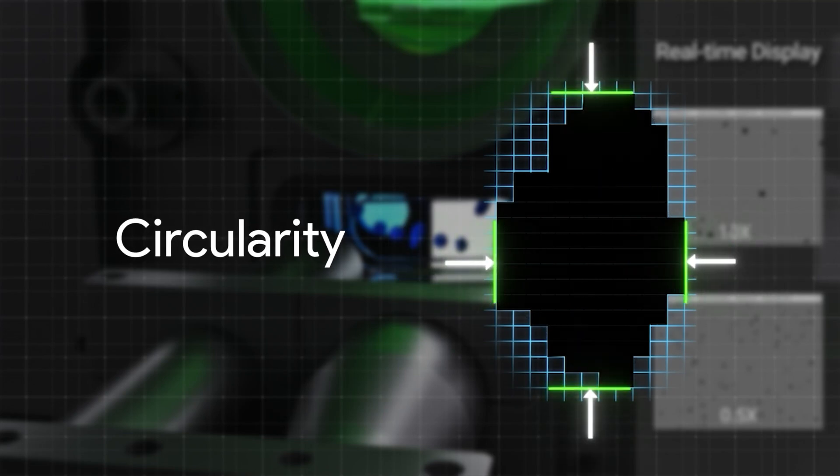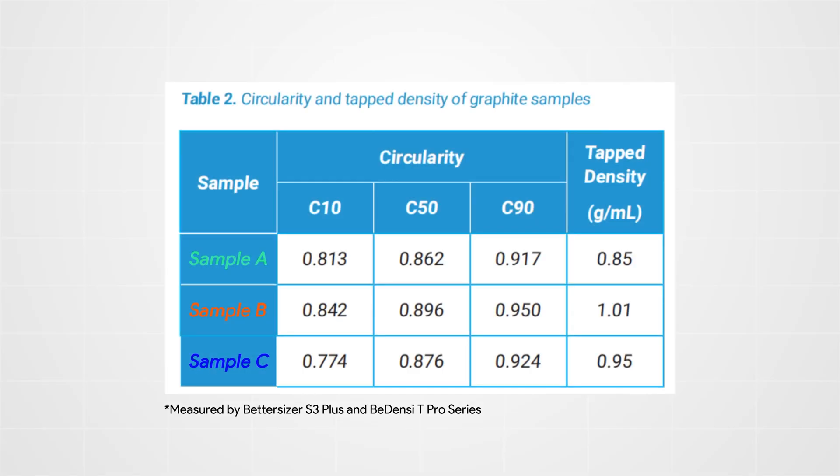The Bettersizer S3 Plus can also analyze particle shape using dynamic image analysis methods. Studies show that the circularity of anode material is positively correlated with its tap density, and the results show that sample B has a higher tap density and circularity than samples C and A. Therefore, considering all these parameters, sample B has the highest battery energy density and the best energy storage potential among the three samples.